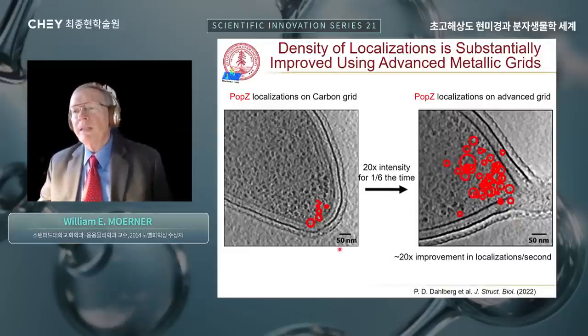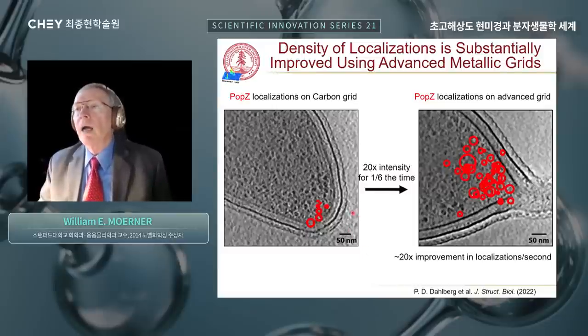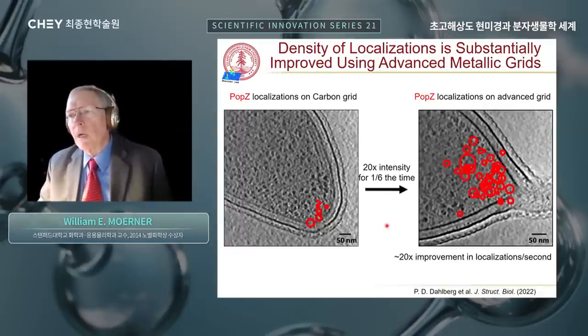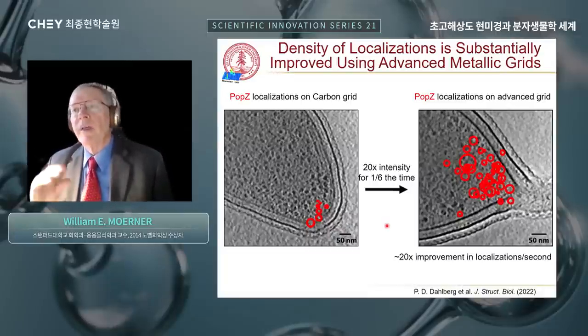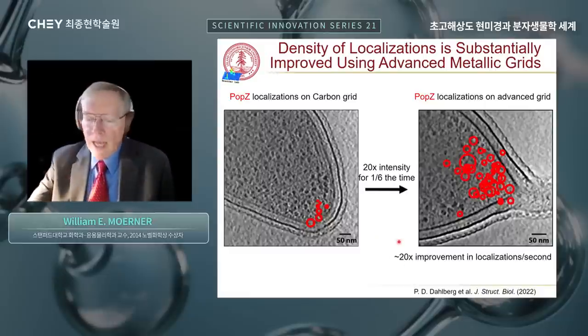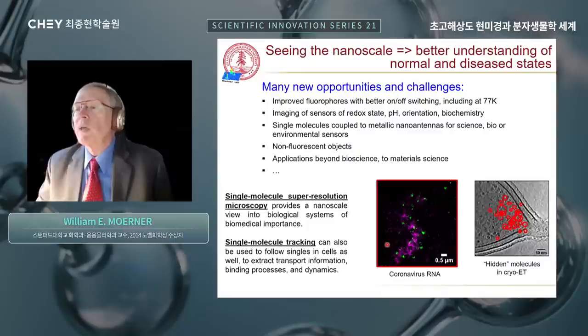Okay, so that's the story about CASM, about combining single molecules with electron microscopy. And you can see this would have many, many applications throughout many other cells. For example, if you think of mammalian cells, they're too thick to be used in the cryo-electron tomogram. So you have to add slicing to make very, very thin lamella. But then in a thin lamella, you can do exactly this. Again, correlating single molecule localizations with the electron microscope image.